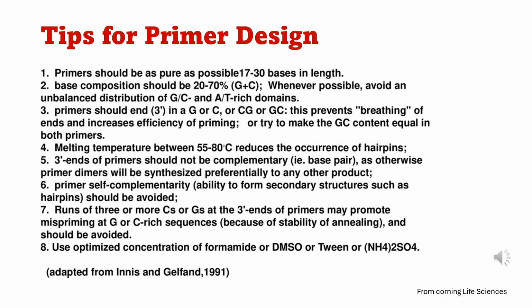The 3' ends of the primers should not be complementary, as otherwise the primer dimer will be synthesized preferentially to any other product, and that can cause non-specific amplification of the target. Primer self-complementarity has the ability to form secondary structures such as hairpins, or they may bind to the complementary primer. That should be avoided.